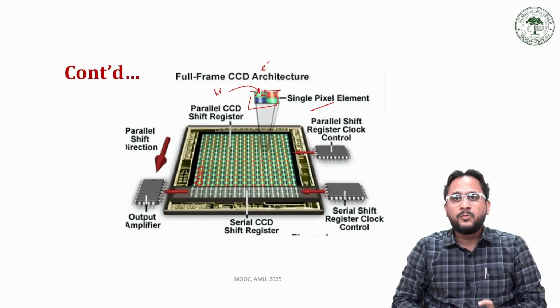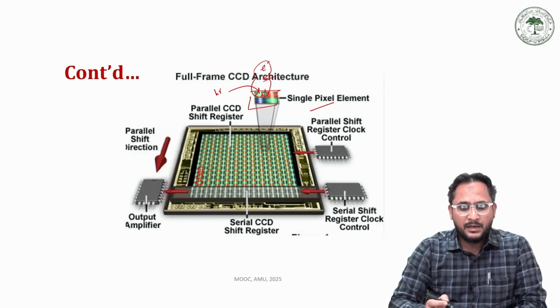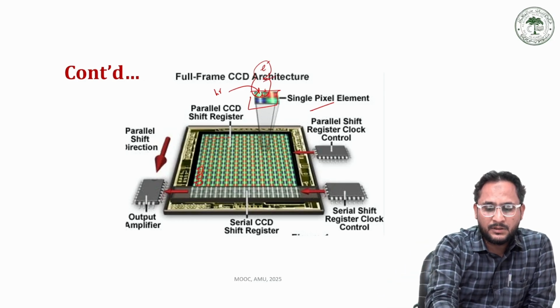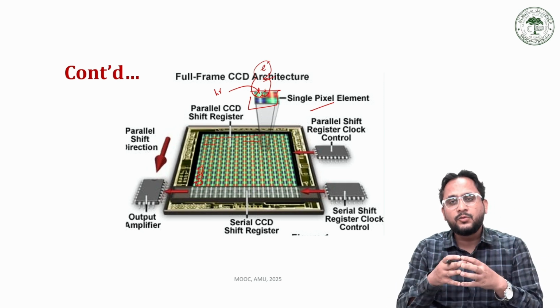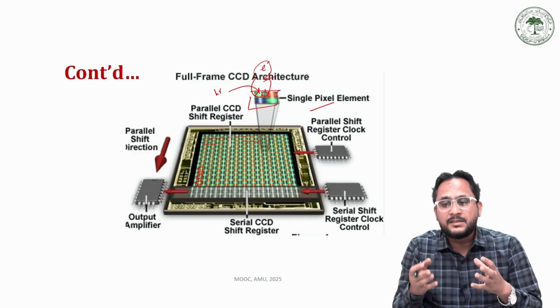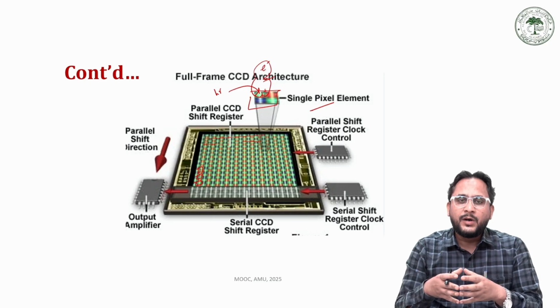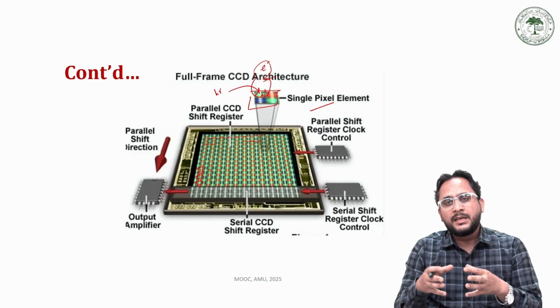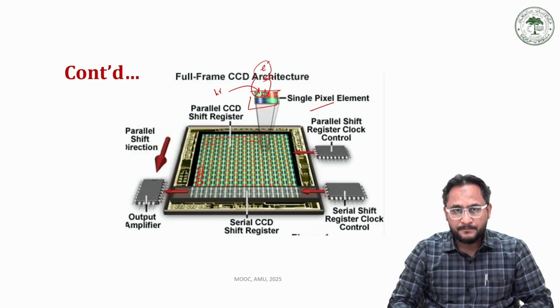This electron hole pair creates charge carriers, and in between we have capacitors that store this charge, and ultimately the charge is released and an electrical signal is generated, and that electrical signal is then amplified, and finally a signal or a peak is obtained in the computer or the readout device.